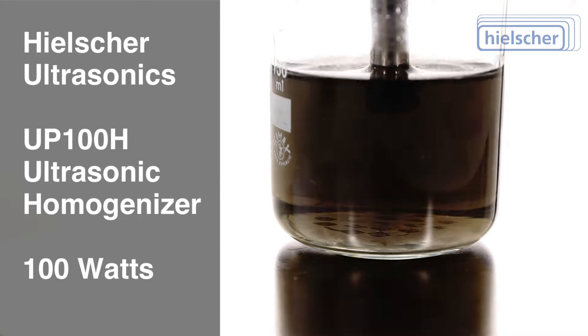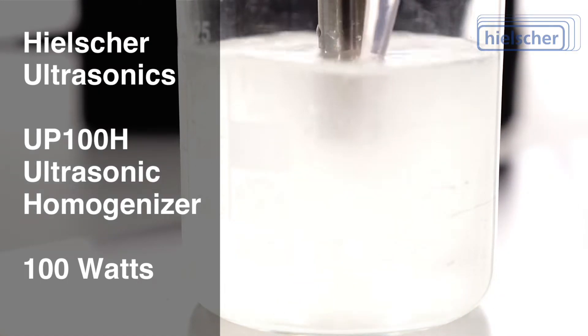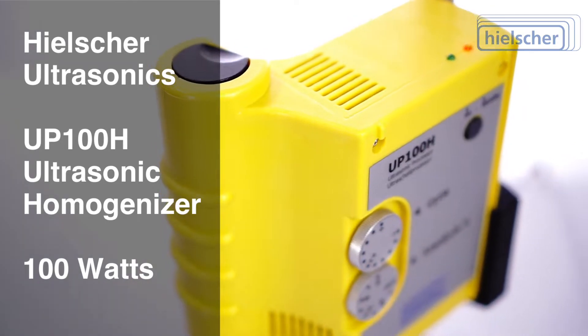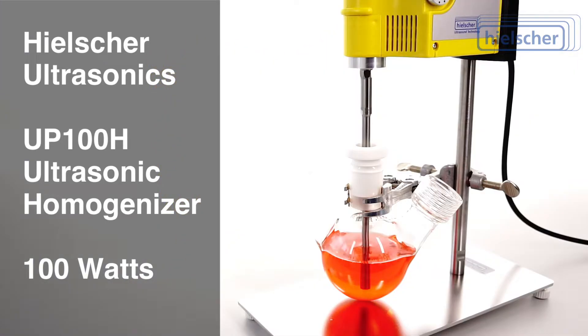If you need to disperse, emulsify, or extract samples of up to 500 milliliters volume in the lab, the Healshure UP100H is the ultrasonic homogenizer for you.